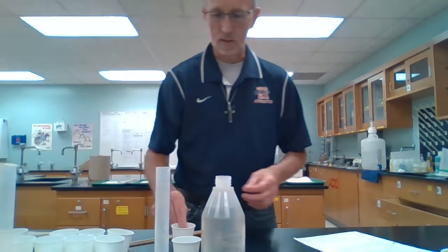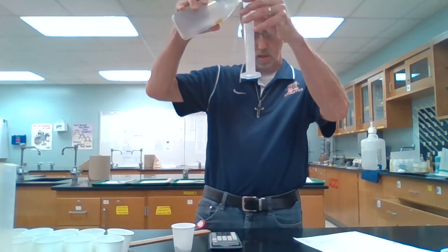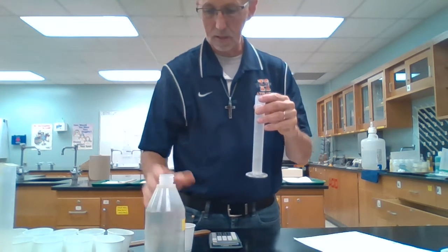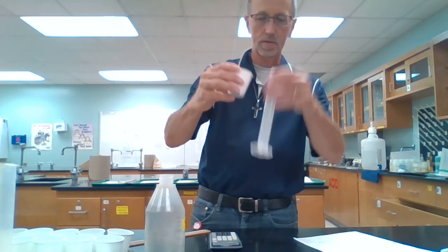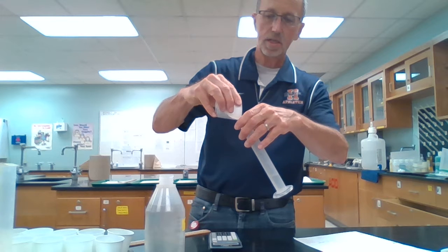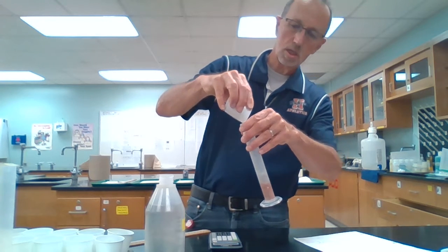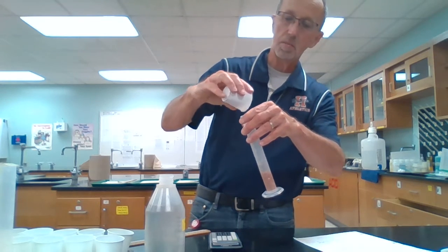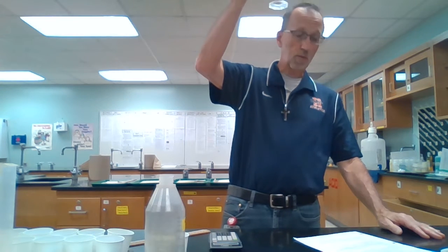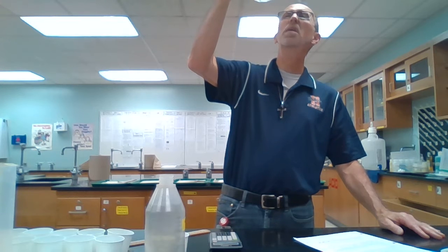Then we'll go to our last one, which again is going to require water, so we'll do water displacement. Got quite a few in here now. It's right about 10.0 again. So I'll put these in here. Got them all? Yep. And that went up quite a bit. 18.2 maybe?